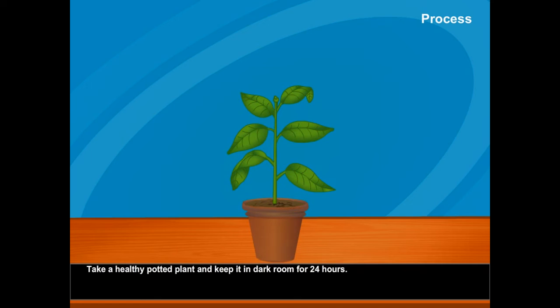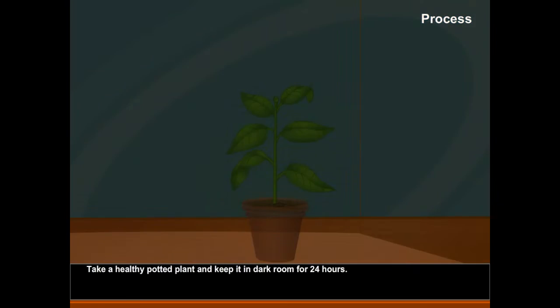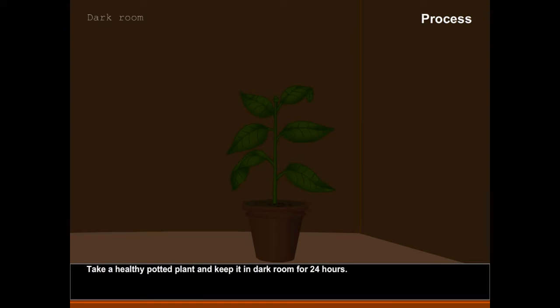Process: Take a healthy potted plant and keep it in a dark room for 24 hours.